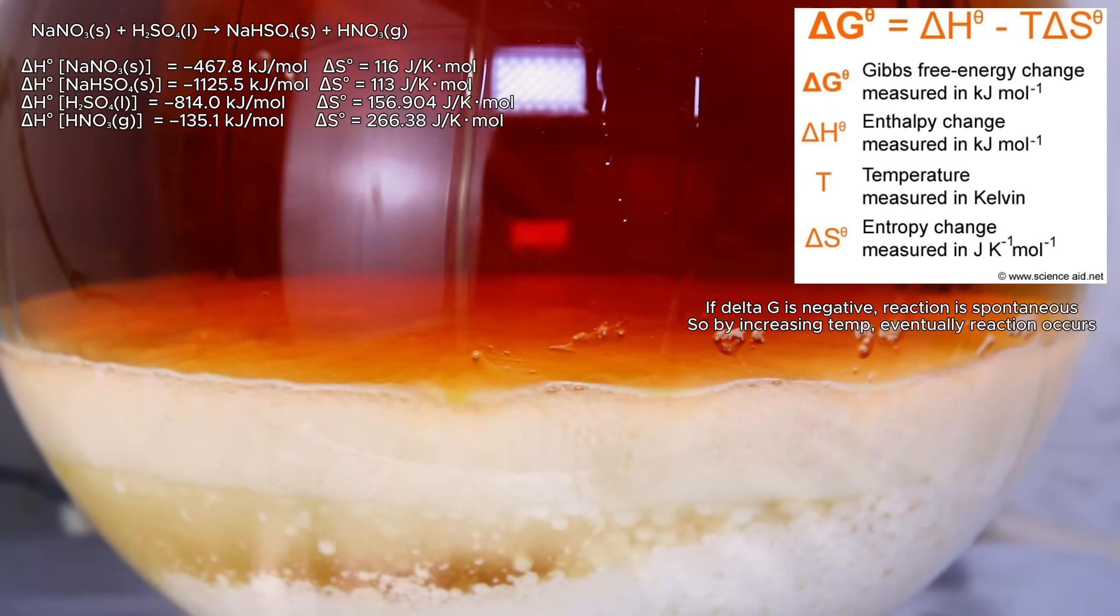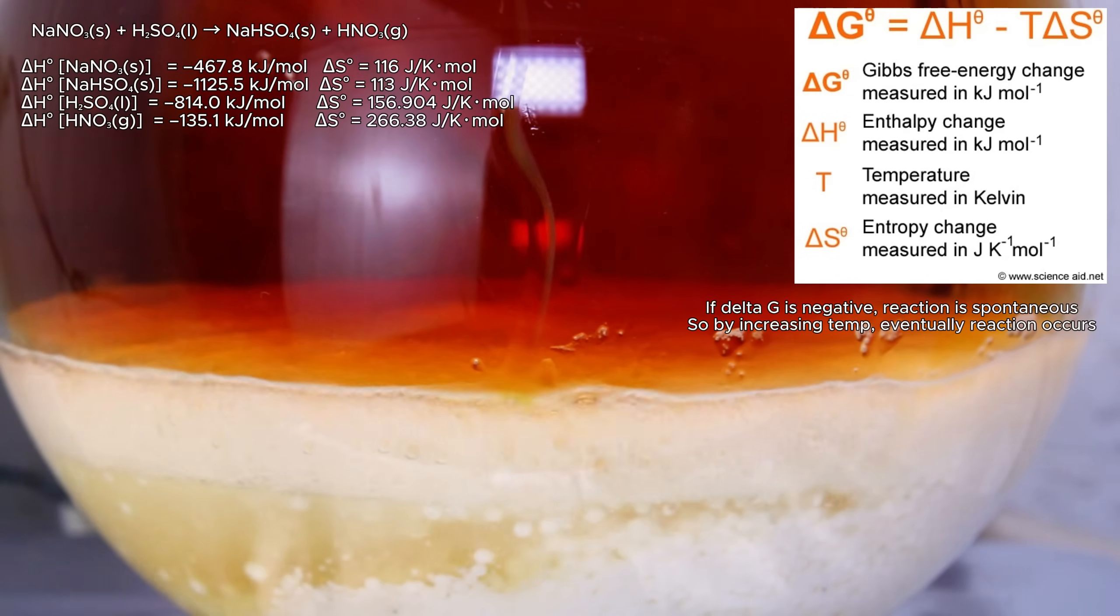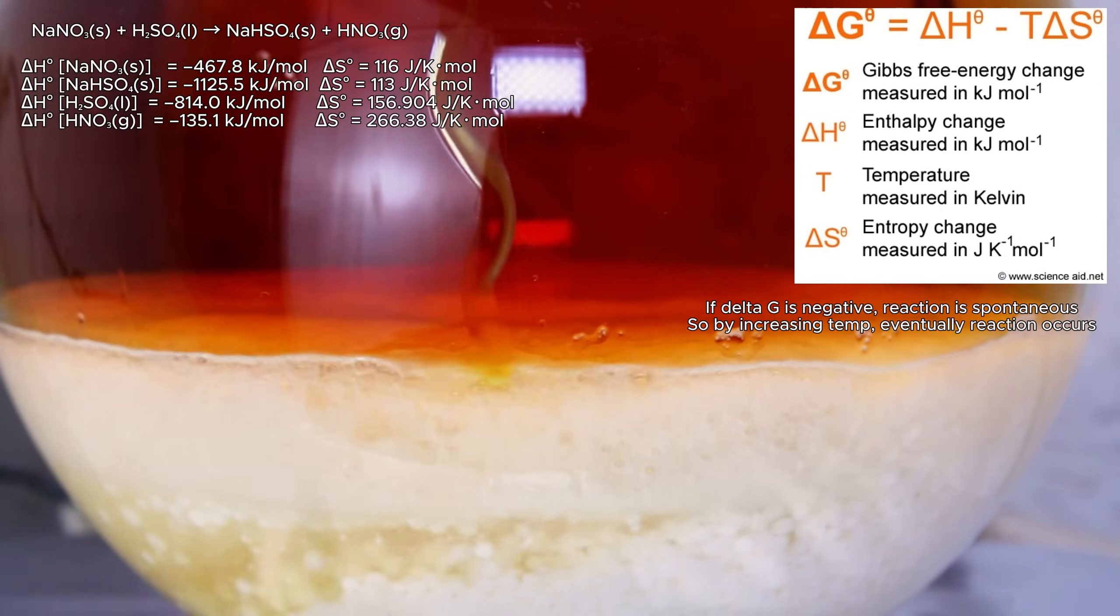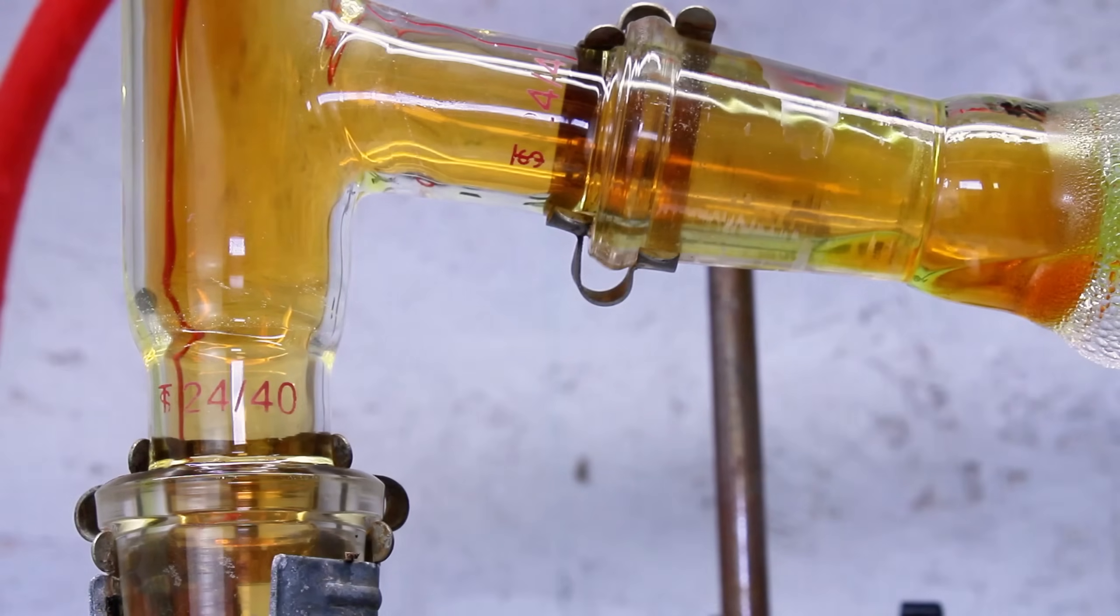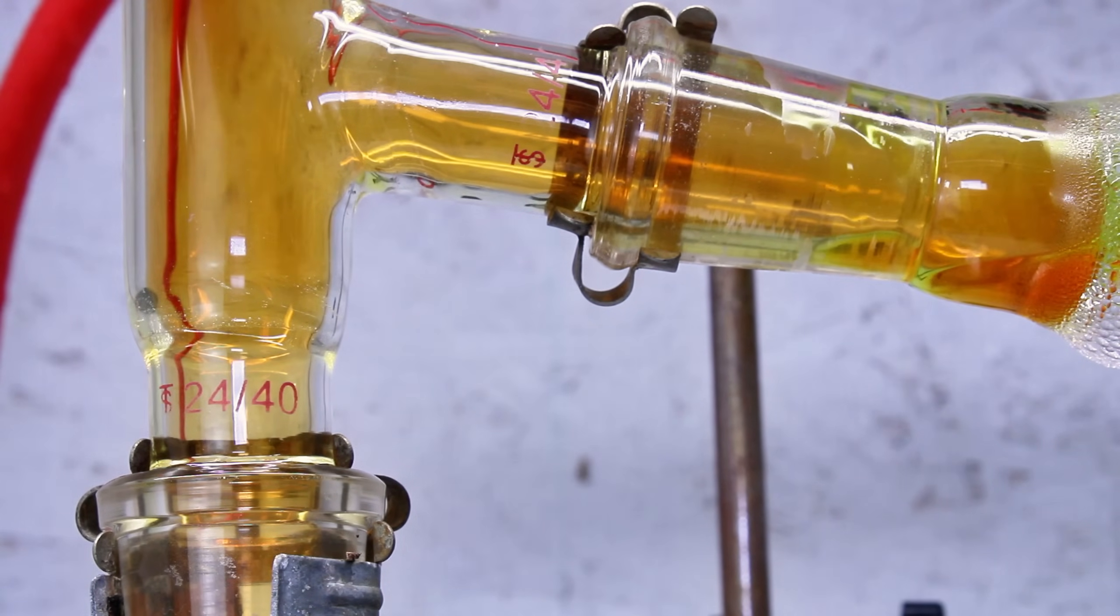Entropy is the tendency of the universe to maximize disorder, and increases directly with temperature. With that said, by heating the mixture above 200 degrees Celsius, you can increase the entropy of the system to the point that it overcomes the enthalpy of the system, and forces the reaction to completion.